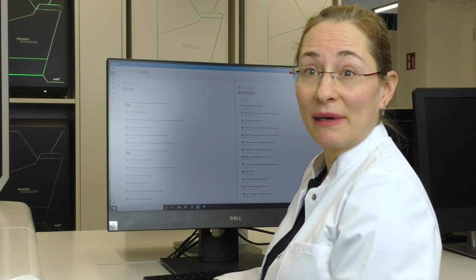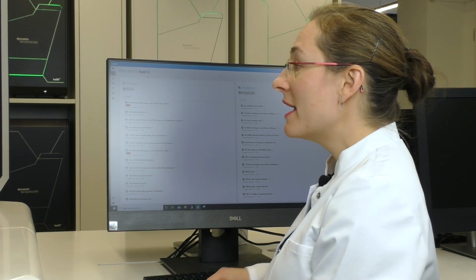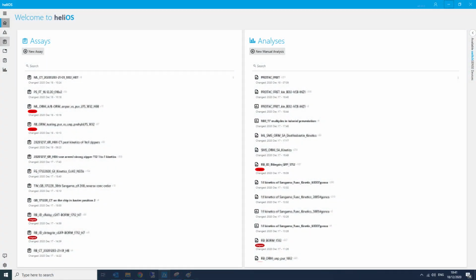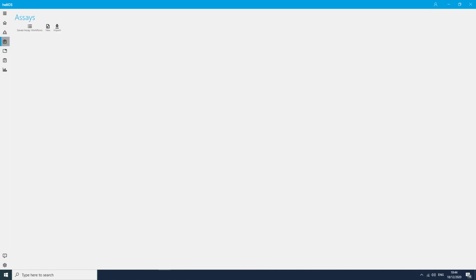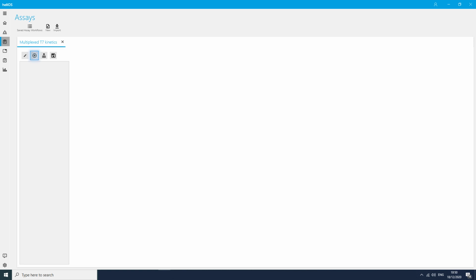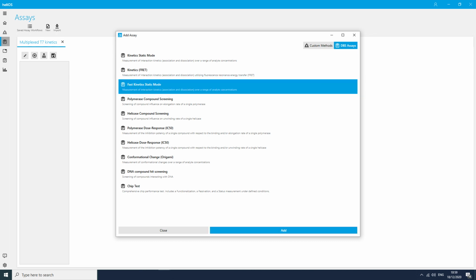With that experimental plan in mind, I will now show you how to easily set up your planned multiplex assay in the Helios software. I will first go to Assays and open up a new empty assay. After entering the name, I can start adding method elements of my choice. For the screening of interaction kinetics, I will choose the fast kinetics in the static mode. This method includes the entire workflow of ligand immobilization, analyte association, and dissociation.